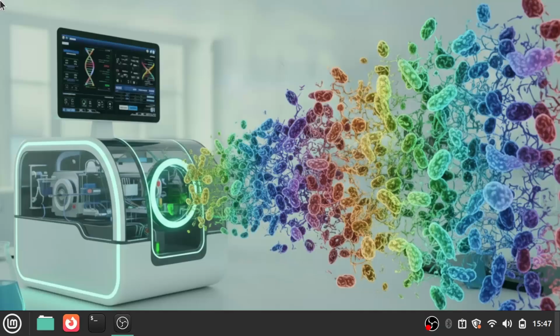Since this course focuses on 16S rRNA amplicon sequencing data analysis, we will demonstrate how to download raw 16S rRNA amplicon sequencing data. Now let's look at the first method for downloading raw sequencing data from the NCBI SRA database, that is direct manual download from the SRA run browser.